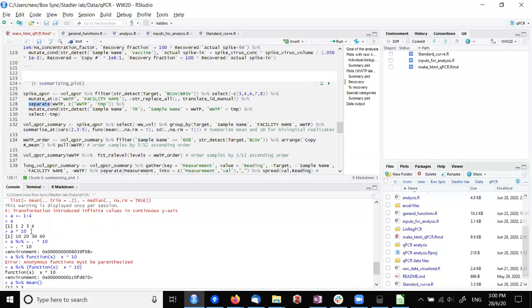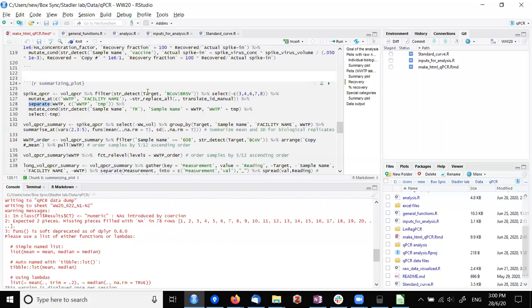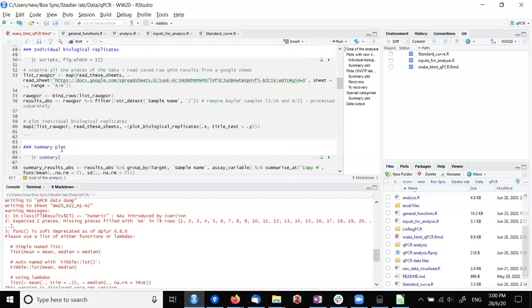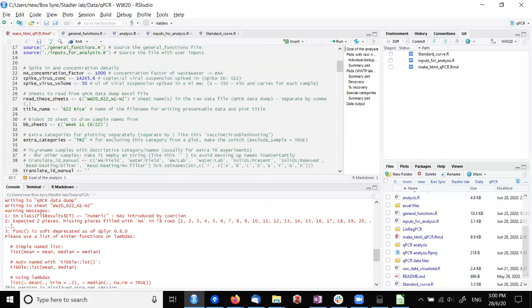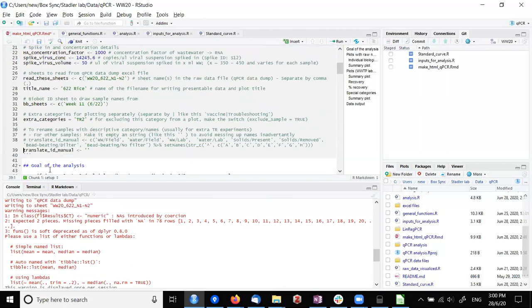So it makes it easy to read. It just takes a little more practice because there's a lot of functions combined into one line. Mm-hmm. So if there's an error in 125, I think it probably has to do with that guy, the error. We can try removing that and see if the error still persists. Okay. I have re-enabled the old stuff.